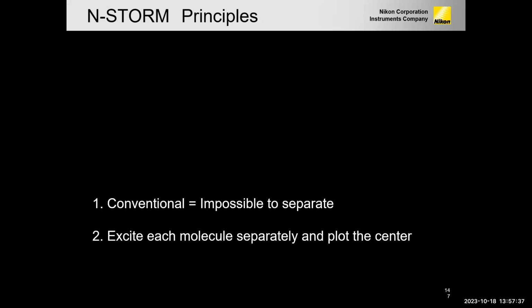So is it possible, because the main problem of resolution is that the two point sources we cannot differentiate between them as two point sources because of the Airy disk, they actually merge at one point because of the diffraction limit. Is it possible that we have a point source or light source so precise, so thin that it illuminates one point?